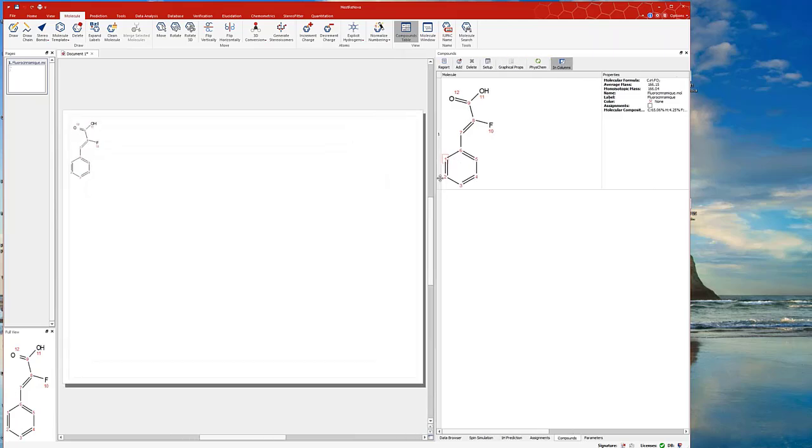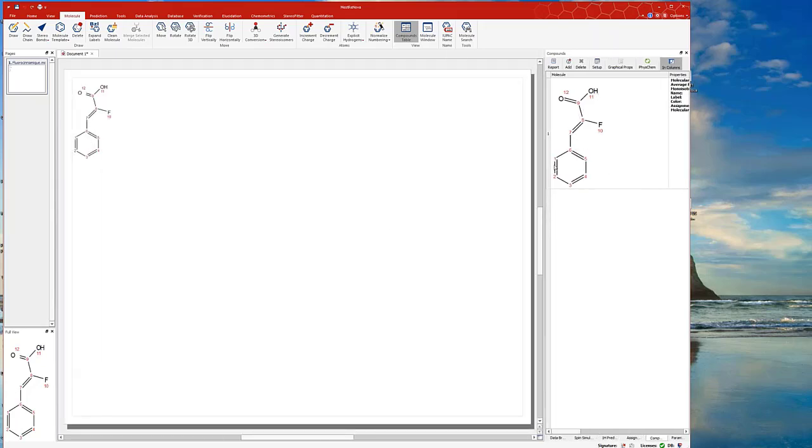And if this is too small for you, remember to use those little handlers to change the size. Make sure it is visible for you, because we're going to use this one to visualize the structure, especially when we have multiple pages here. Okay, so we have a structure, and now we're going to do the prediction.